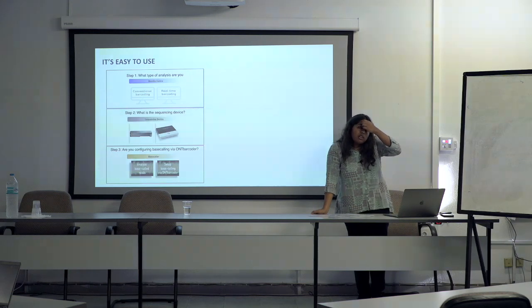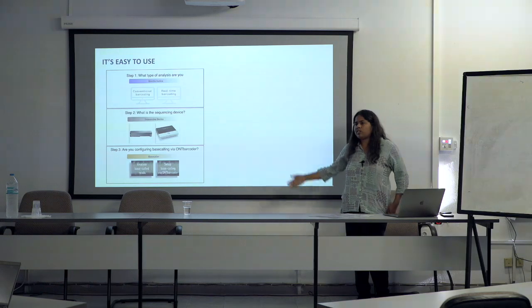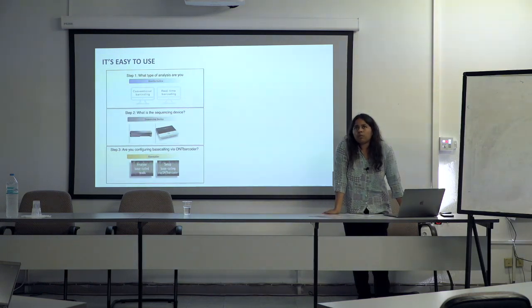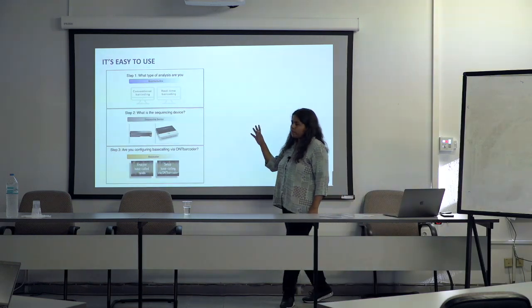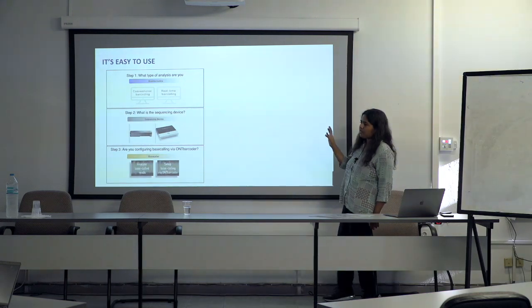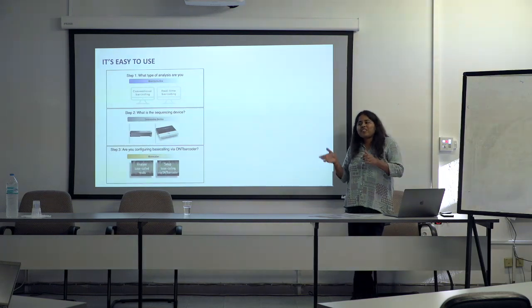So we have worked with people who have used it for RBCL. That's been okay. You can change the organism setting, and as long as it's protein encoding, at least the QCs, we know how to assess it. I think it's by and large quite accurate, it's just that you might have a few indel errors there. The issue for us was the homopolymer errors, and those were systematic in earlier days. That was one of the reasons we limited it to protein coding, because we had a way to assess what our length should be. But of course you can do it.